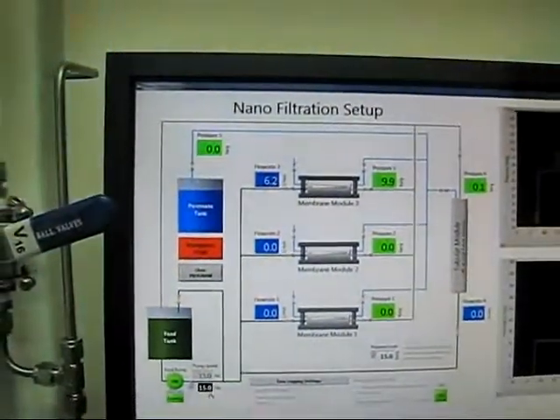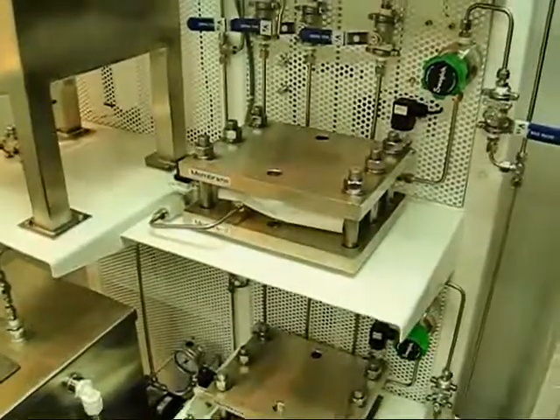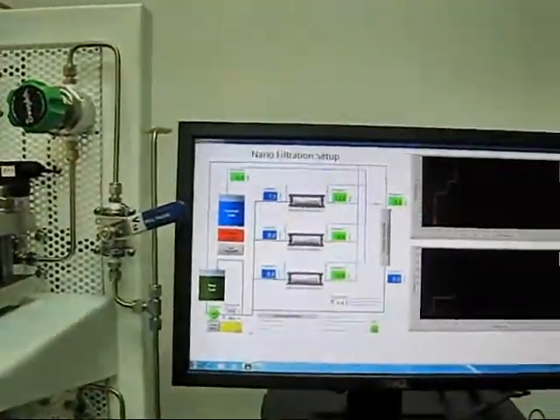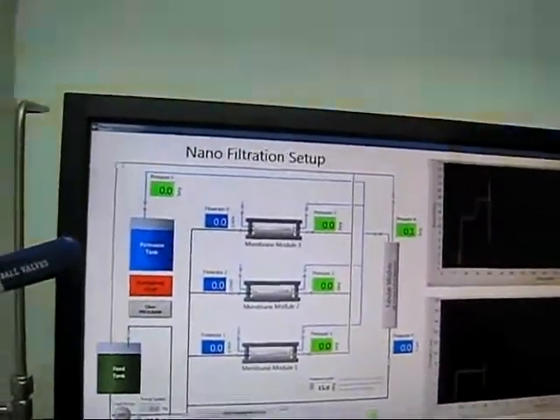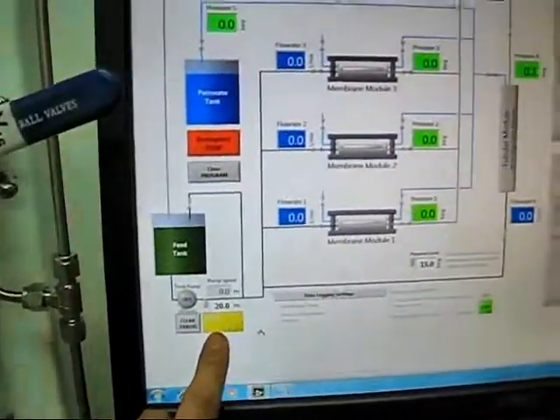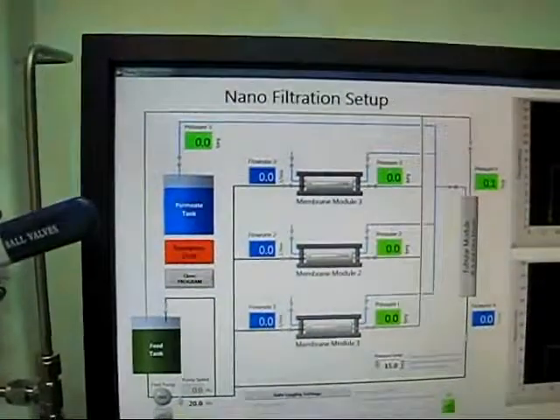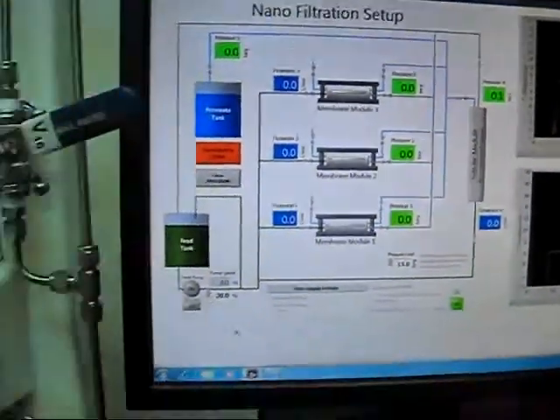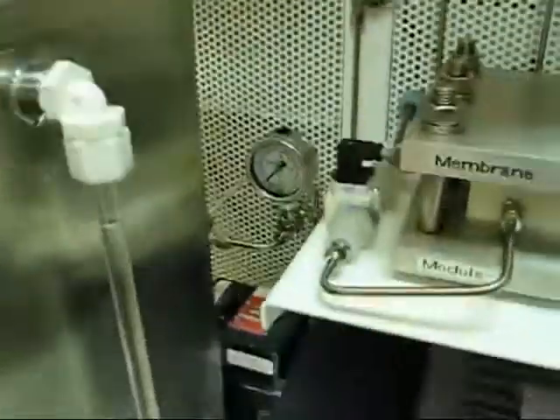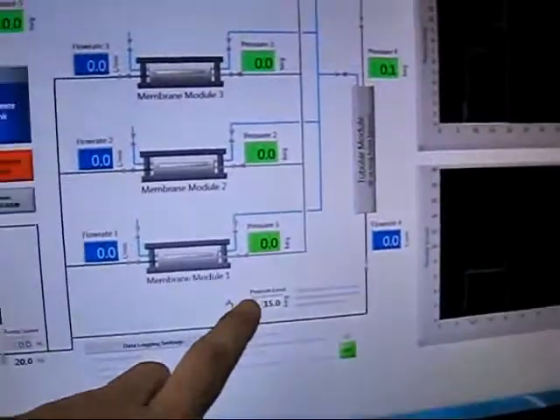Let's say we go up to 20 Hz. The noise level is going to go up and you will see that it overpressures very, very quickly. The program itself will activate its emergency shutdown. There's an overpressure error — you need to physically stand by the computer and click the clear error button to clear the error and move on with the experiment. As we increased the flow frequency of the pump, the pressure along the line built up to beyond 15 bar, which is the pressure limit we set here.